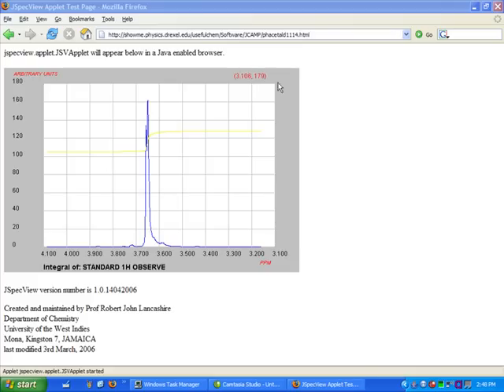On the top right corner, there are two numbers that are giving you your position at all times of the cursor. So if we look at the top of the integration, we're looking at roughly 125. Right? And underneath is 105. So we're looking at about 20 units for two hydrogens.